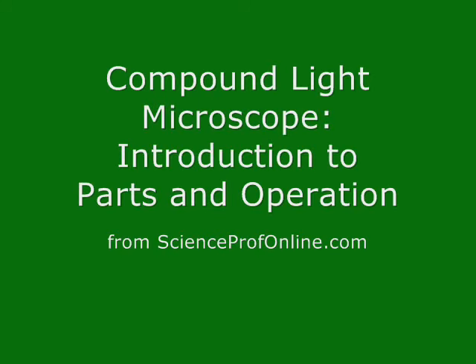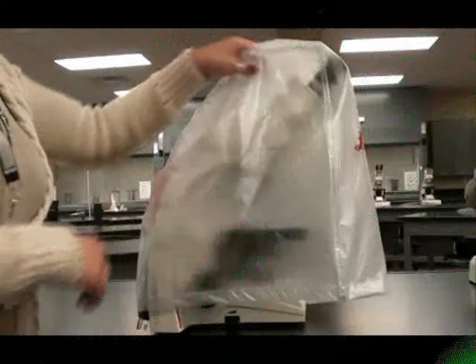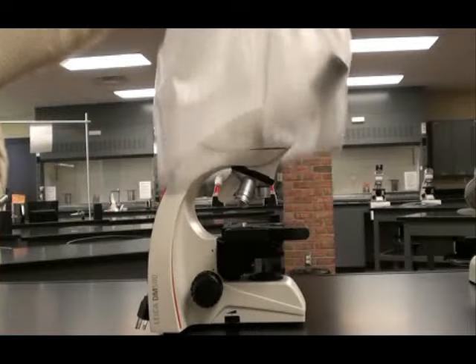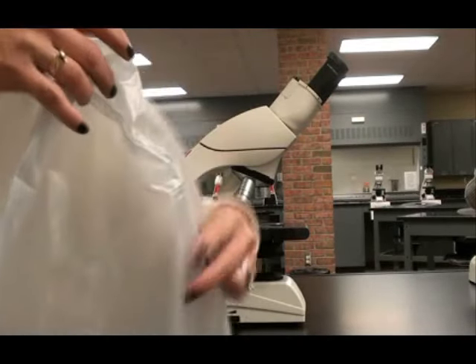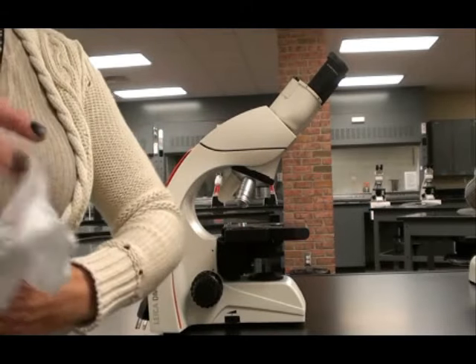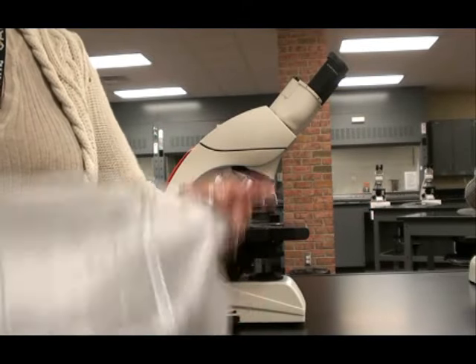This video is an introduction to the parts and operation of a compound light microscope. Once you transport your scope back to your station, remove the dust cover, fold it up, and place it in an out-of-the-way location to keep your workspace uncluttered.